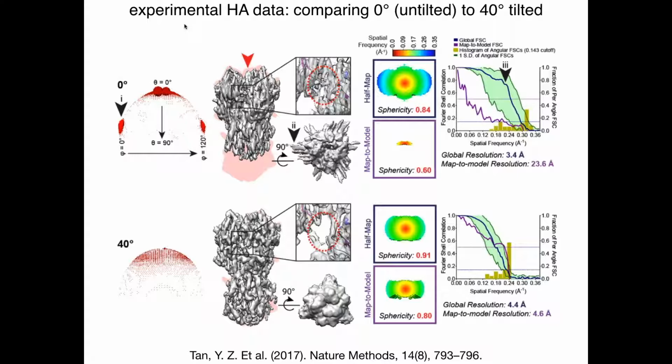And since then, we deposited this data set. This data set was then picked up by a number of people developing image processing methods. Again, keep the data. And actually, this particular data set has been pushed to about 3 angstrom resolution, a real 3 angstrom resolution. And I expect that as methods improve, others will improve on this even more.